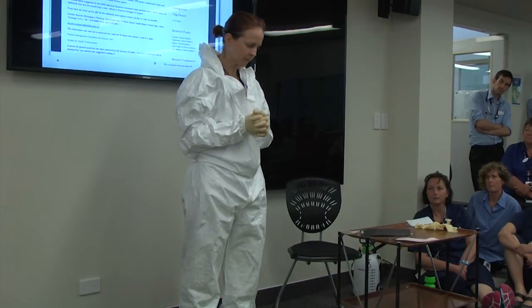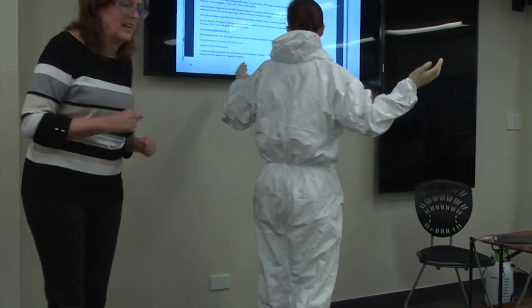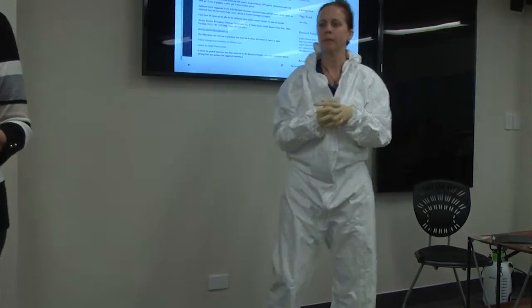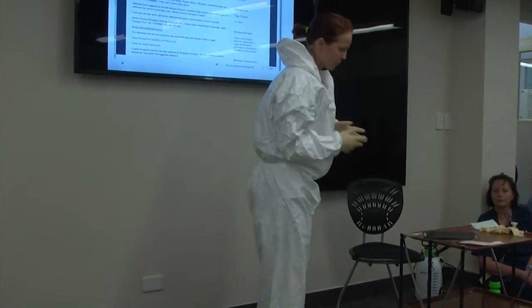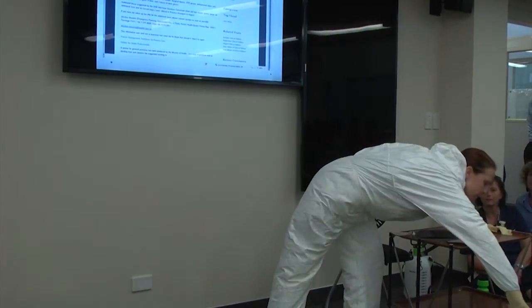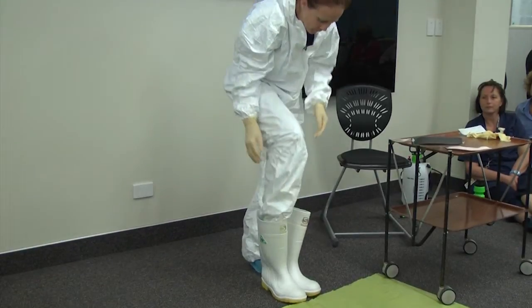I will now inspect your suit to see if there are any holes or tears. You may now put your boots on. The boots go underneath the Tyvek. She already has some covers on her feet.